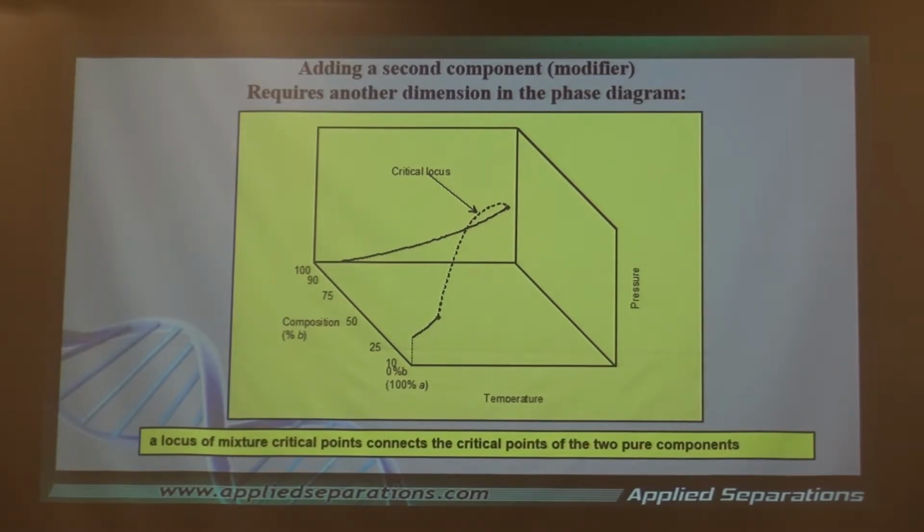Now this is important when you add solvents to the supercritical CO2. We saw before the supercritical point of carbon dioxide, for example, here, based upon the pressure and the temperature. Now, as I said earlier, everything can be made supercritical. Let's say we have another solvent here. Its supercritical point is here. It is different. So you can't use the conditions of carbon dioxide, its supercriticality.